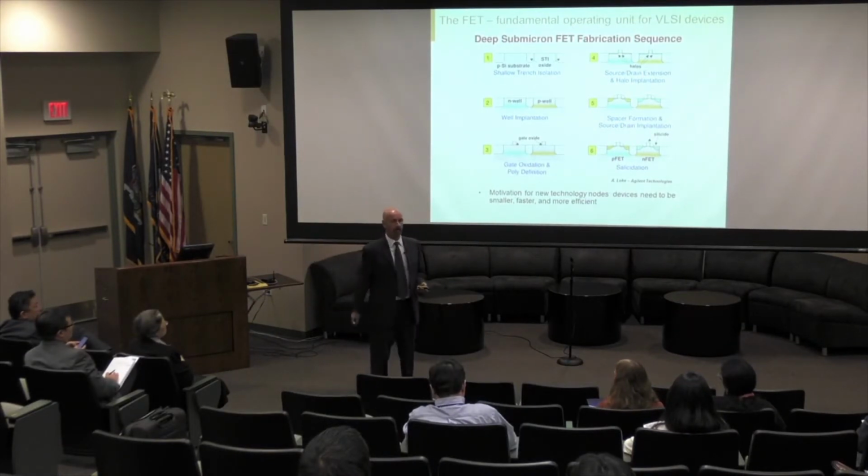You take a chemical that was mixed that would preferentially etch different doped regions and then look at them in an SEM. Well, that worked great with large devices. But as technologies continued to shrink, you couldn't use that method anymore. It wasn't accurate enough. So now what are we going to do?